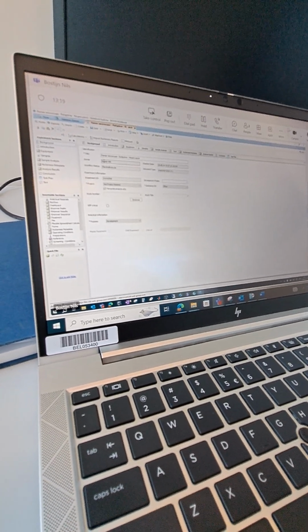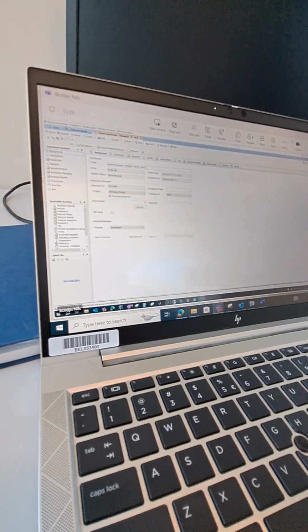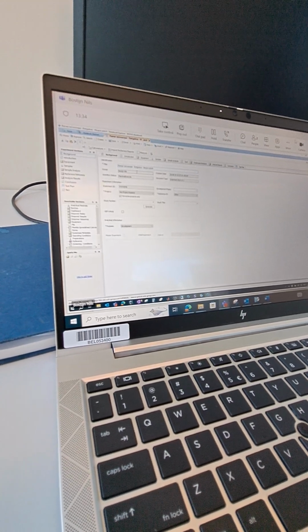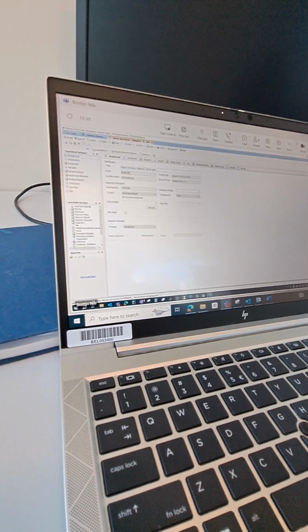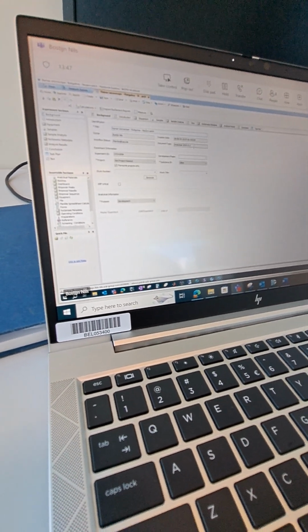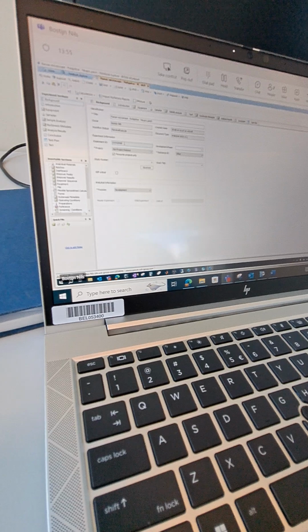This is some information about the ELN. So you will have the title. It should be the same title as you gave before. As I said, you can still modify it here, and you can write whatever you want. Then the gray fields will be automatically completed. The owner, which will be your name. The workflow status, I will show you later what it is. Then when it was created and which template we are using. We are using an analytical template. Then this is very important: that's the ID of the experiment.